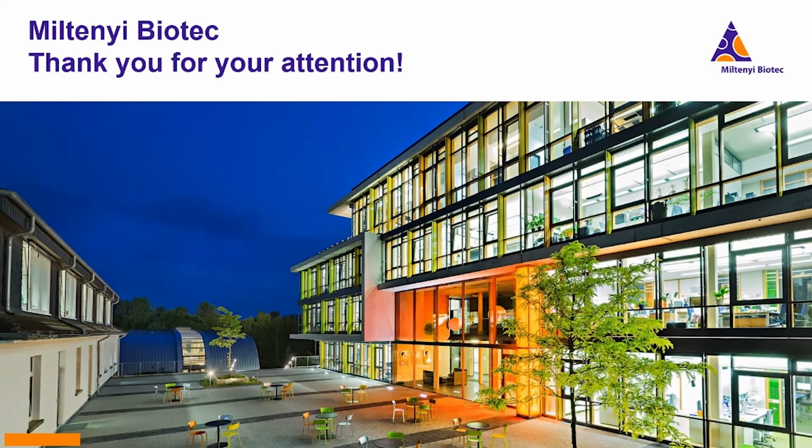What we could see is that the quality of the outcome is a little bit better when you dissociate your cells prior to cryopreservation. So this is what we have seen first. And the other thing is it is per se possible, but I would not compare it to fresh material because fresh is a different level of quality. So whenever fresh is possible, go for fresh, but cryopreservation can of course be considered as well.